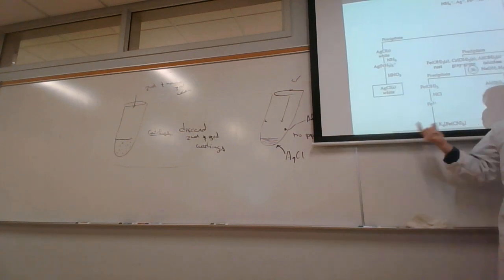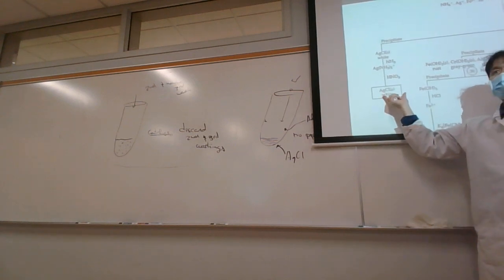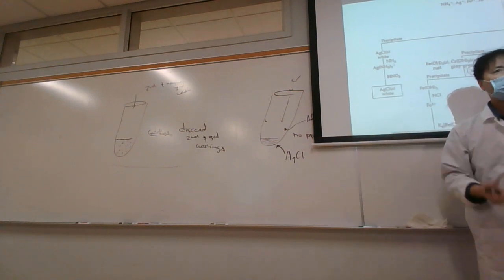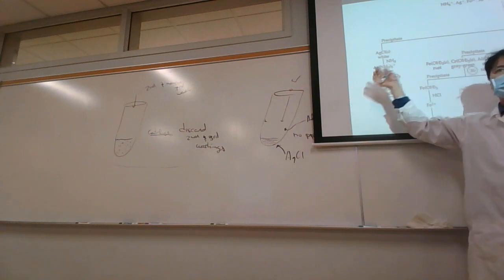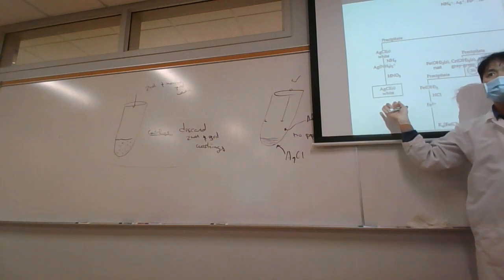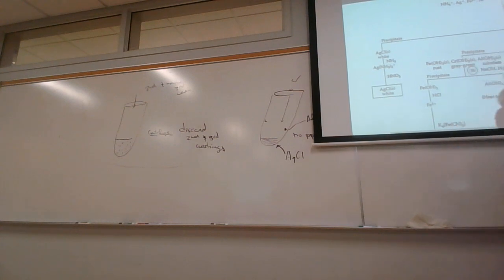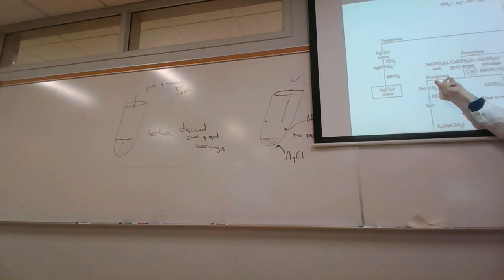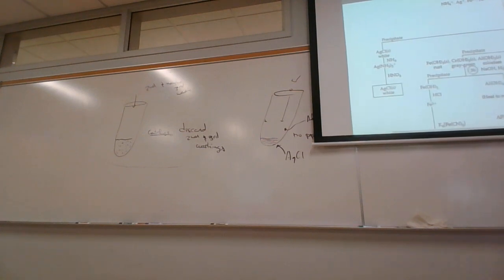What happens is every semester somebody comes up to me and they get some kind of black precipitate here, and they're thinking, what's this black precipitate? Why am I getting black precipitate here? Well, it's because you didn't wash it well enough. Some ions got contaminated in here, and they're giving you some bizarre results over here. And so we need to wash this. That goes for all these precipitates. So this precipitate, first wash goes with the decantate, the solution. The second, third wash will be discarded. Yeah. This precipitate, same thing.